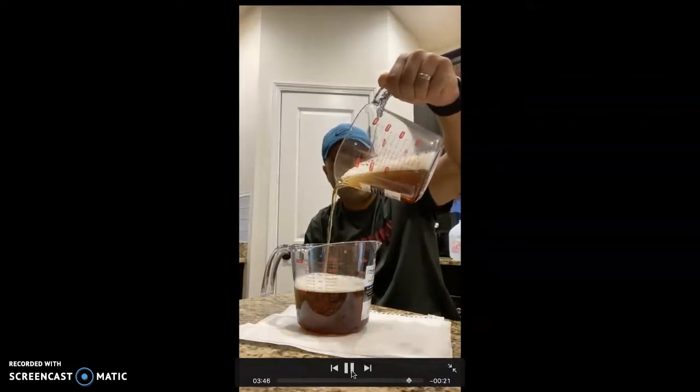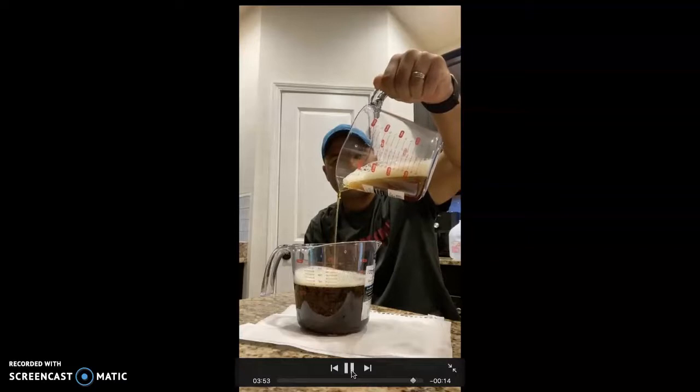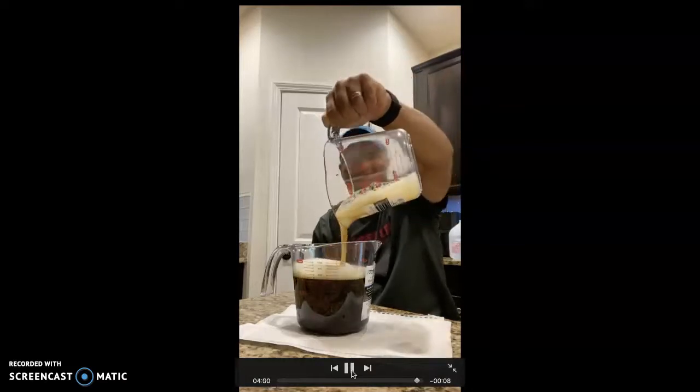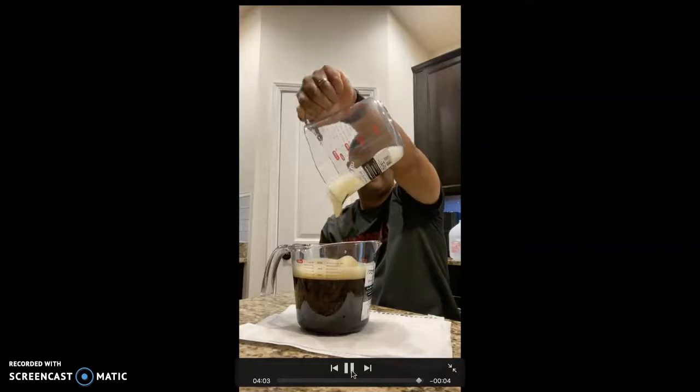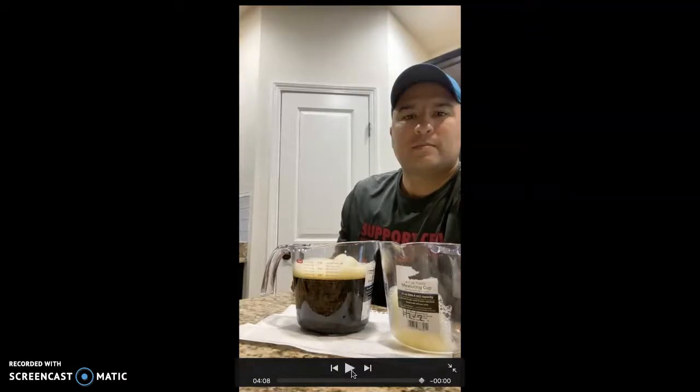When I was preparing the solutions the first time, I didn't realize that my bottle of iodine was only 1% iodine, and I only used like 25 milliliters and mixed it like that. And when I mixed the solutions, it took forever to change in color. Actually, it didn't even change in color basically. So when I realized I only had 1% iodine, I had to change the solutions and put five more parts. So instead of 25 milliliters, I had to use 125 milliliters of iodine to make up for the 1% concentration.